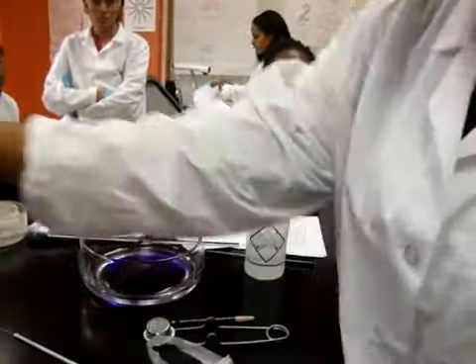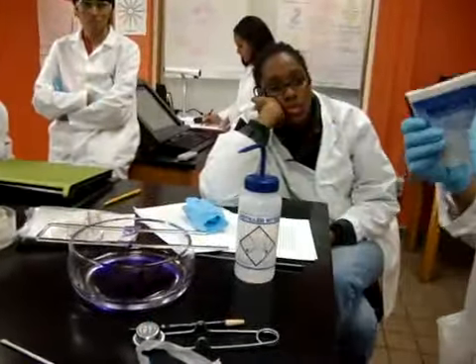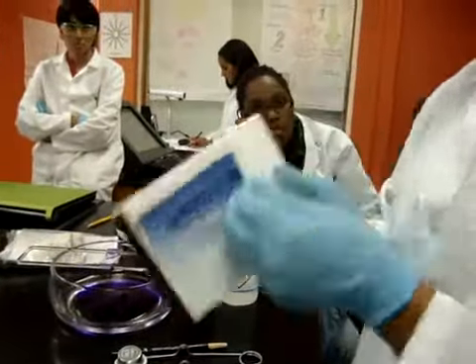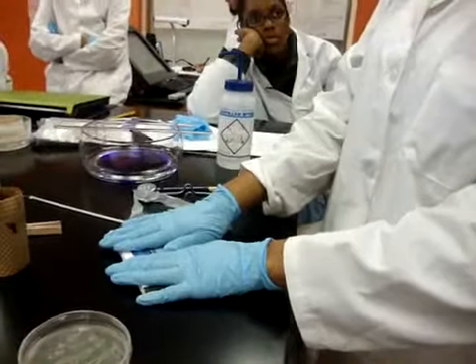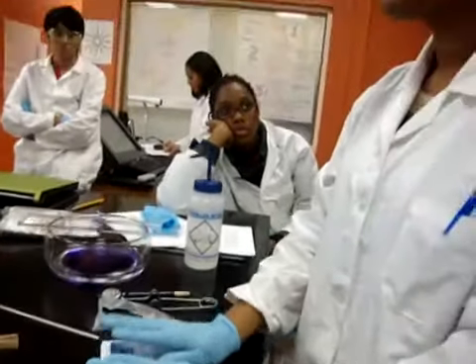And then the last thing you have is some bibulous paper. Every desk has a book of bibulous paper. You don't need to rip the paper out. You just open it, put your slide down, and close it over it to let the water absorb away. And then you can view your slides with the microscopes.